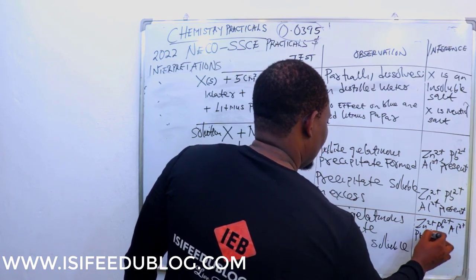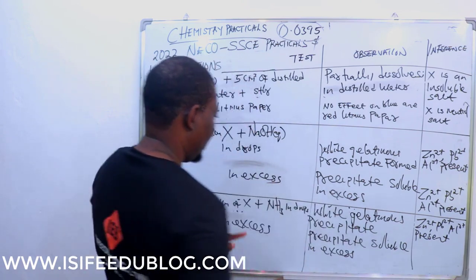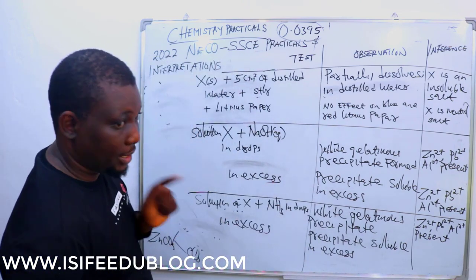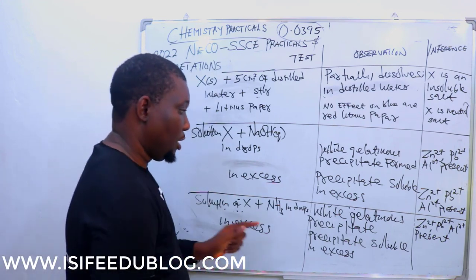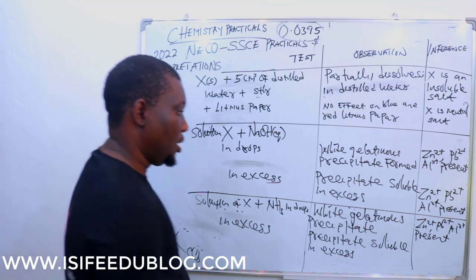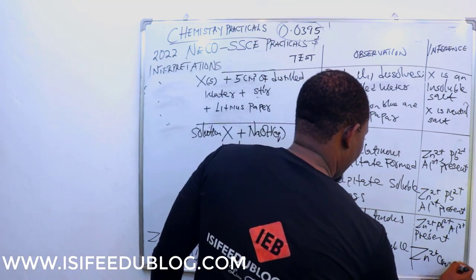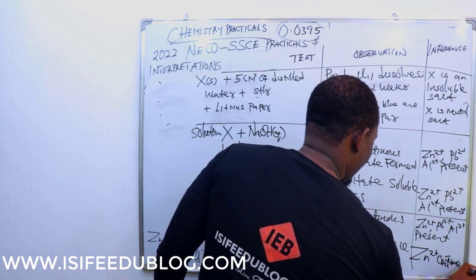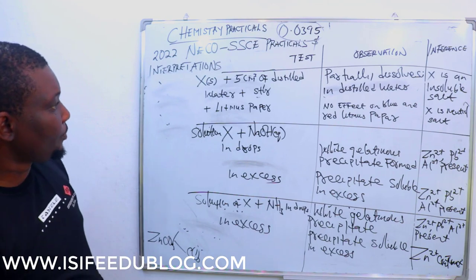All are present at this point. But here, out of the 3 of them, zinc is the only transition element. So it's going to form complexes with the ammonia. So in that case, you have to confirm this one. Zinc confirmed at this point in time.